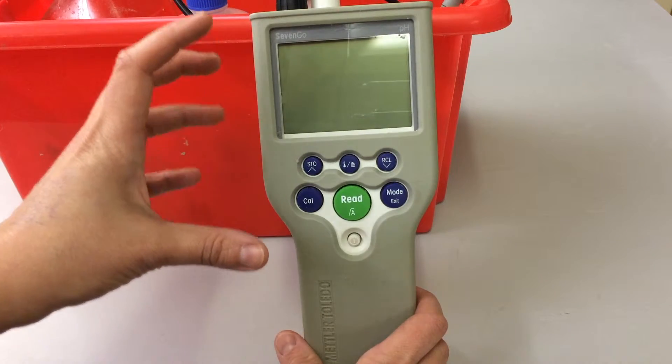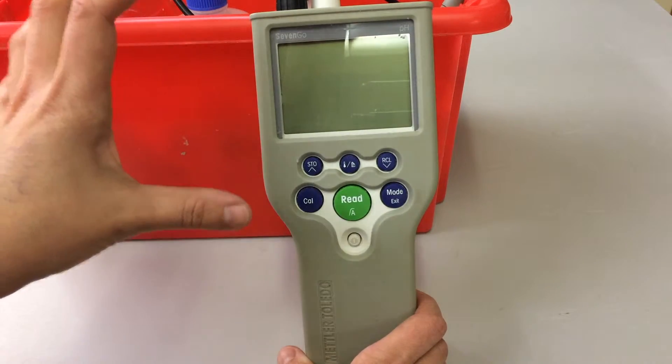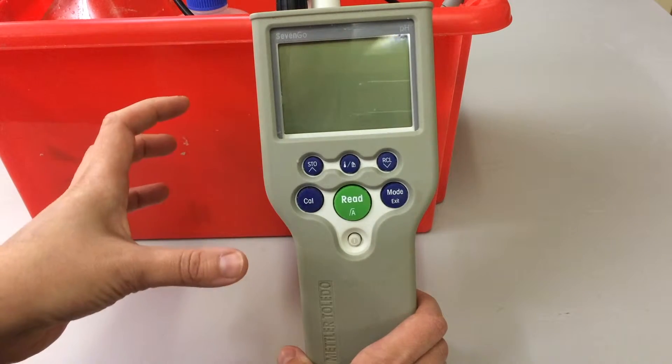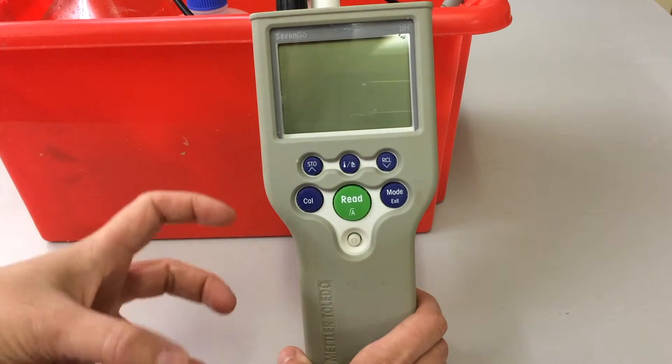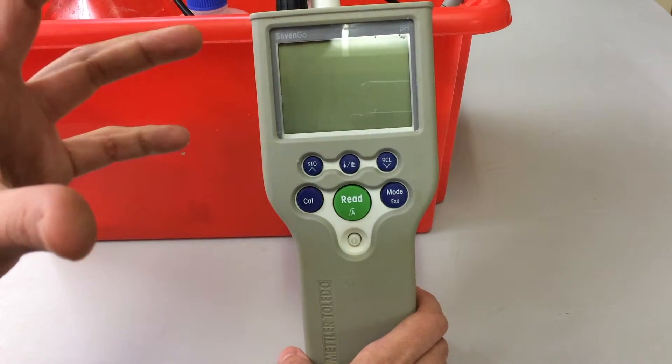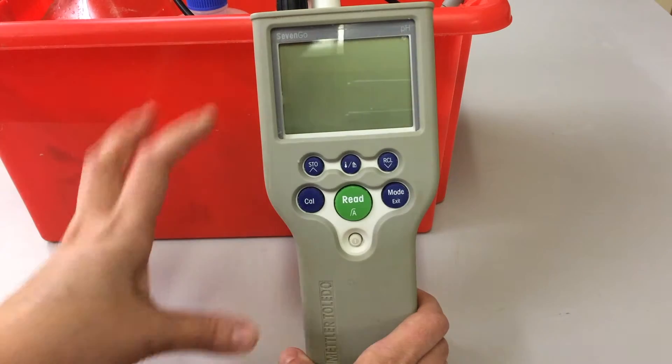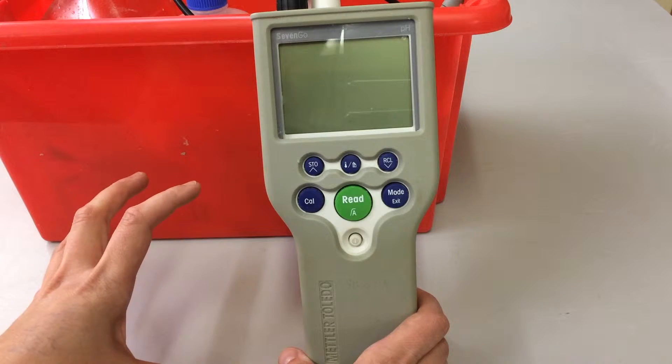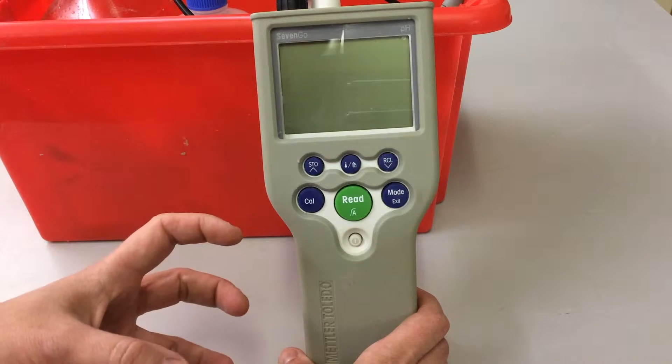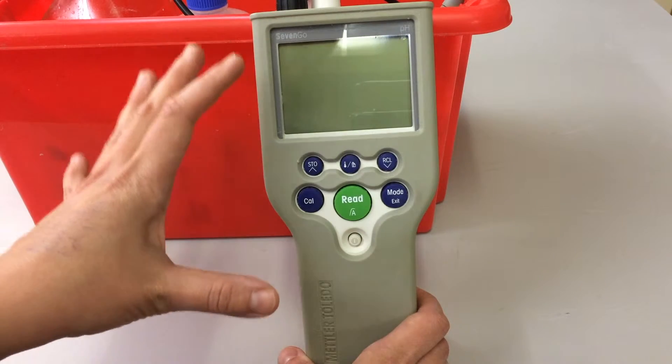This is actually a great model to use. It's quite robust, although it is quite expensive, maybe from a student perspective, so it's worth ensuring that you do look after this piece of kit. It's waterproof and it's a very reliable piece of kit. So anyone who is wanting to measure pH in seawater and they want it to be temperature compensated, which is what this piece of kit does, I would really highly recommend it.